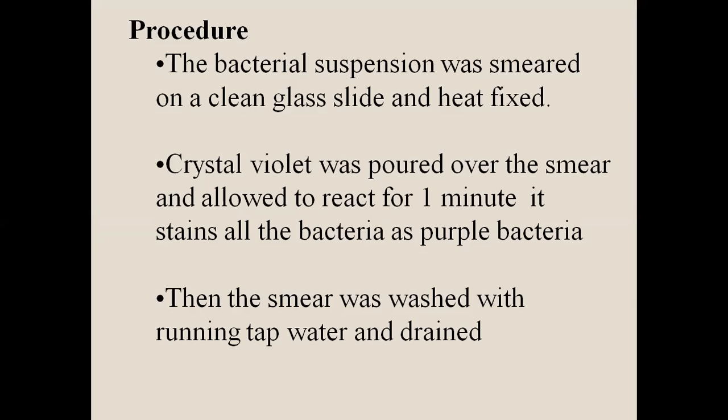The bacterial cell wall will break down, and even the glass slide will also break down. So you just gently expose the slide to the heat so that the moisture content in the suspension will evaporate, and the bacterial culture will be dried and fixed on this slide.